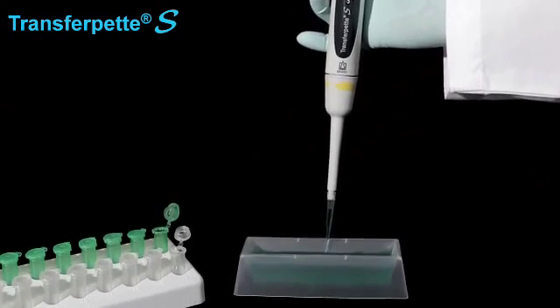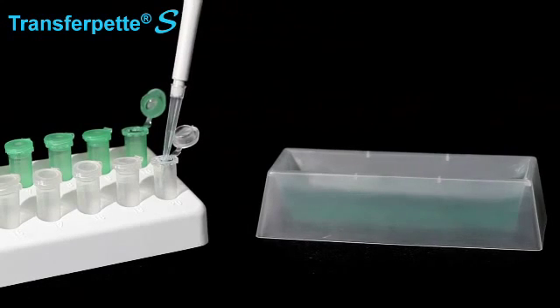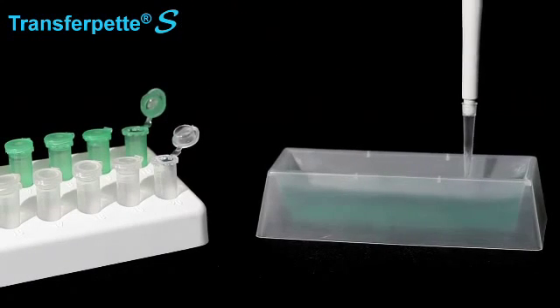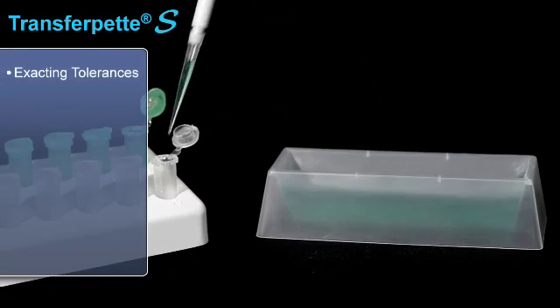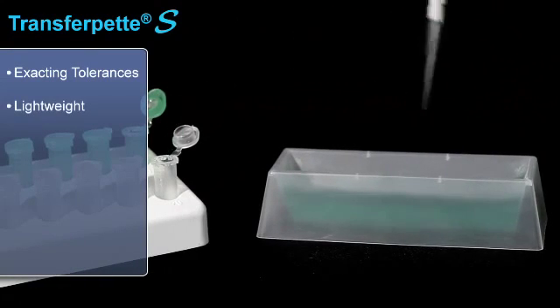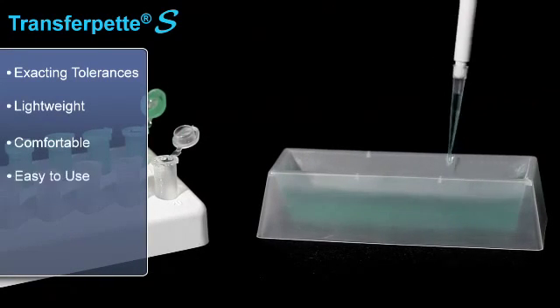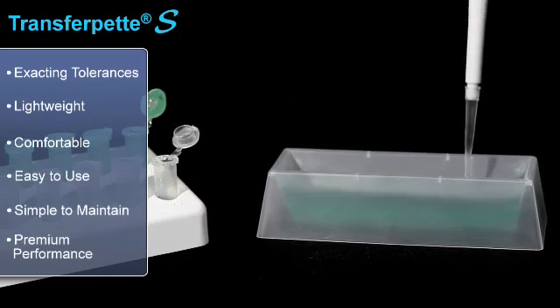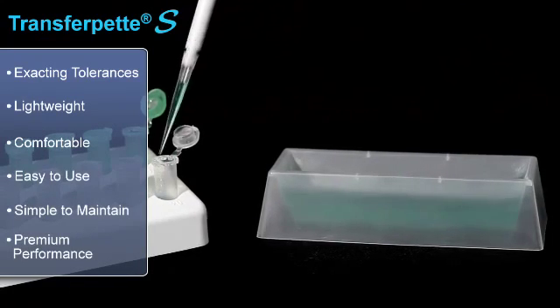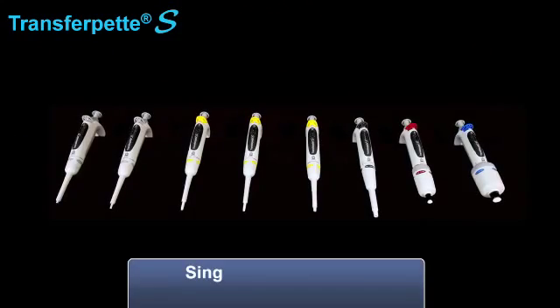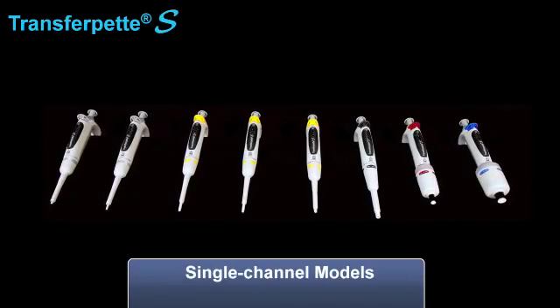The Transferpette S incorporates advanced materials and innovative design features. Manufactured in Germany to exacting tolerances, it's lightweight, comfortable, easy to use, simple to maintain, and delivers premium performance. It's also fully autoclavable and available in single channel models.